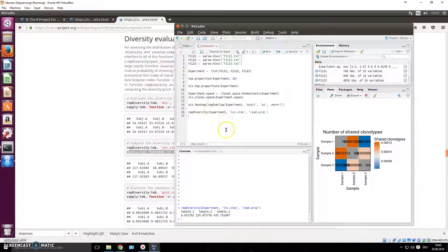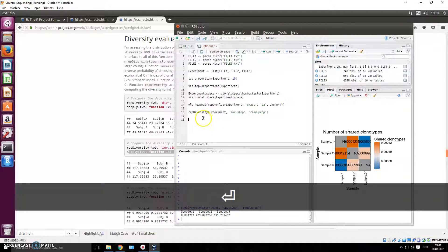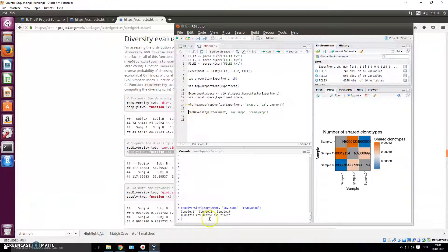That's enough for working with TCR for now. You can go through the documentation and learn much more, see what you want to use for your experiments, and run all of these analyses. One more thing I want to show you is how you can save this information as a text file.